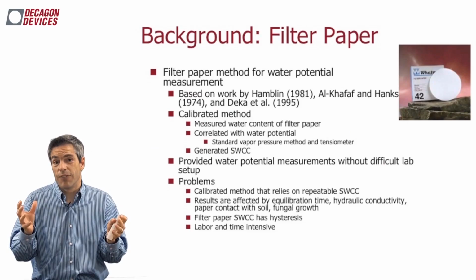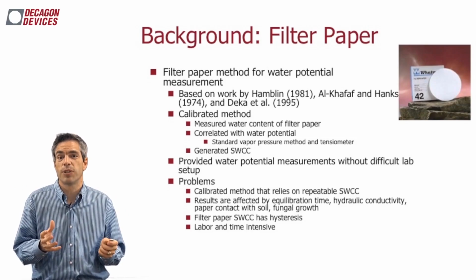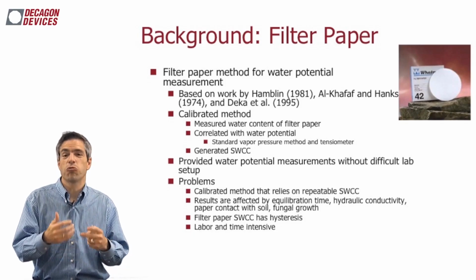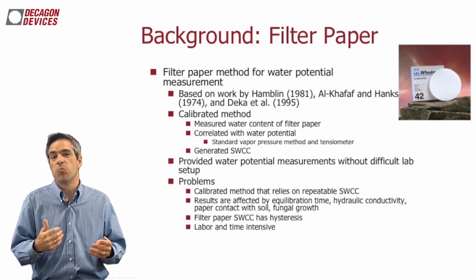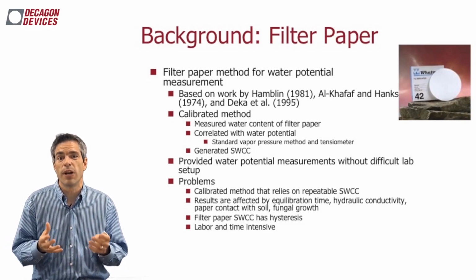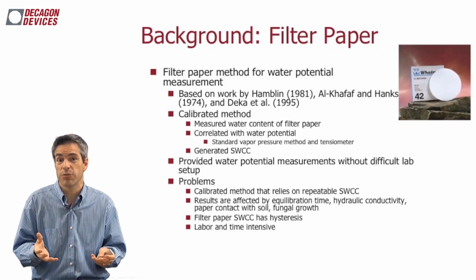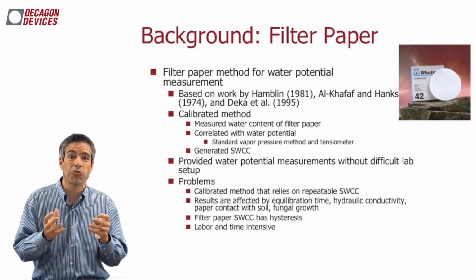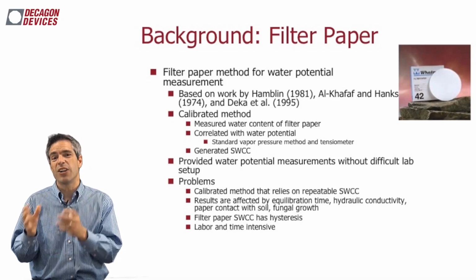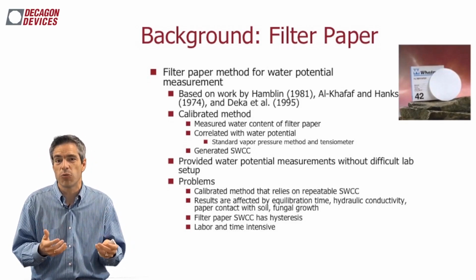Now, filter paper. I showed it in the last slide. It's a pretty common technique of measuring water potential in some areas. Now, it's been around a long time. Let's rewind the clock back to the 60s, the 70s, and 80s, when the only technique for measuring dry soil water potential really was this thermocouple psychrometer that I talked about. And I mentioned it there, reiterate it here. It was a difficult measurement to make. What people said was, well, I don't have hours to wait for my thermocouple psychrometer to equilibrate, not getting the accurate numbers like I really want anyway.